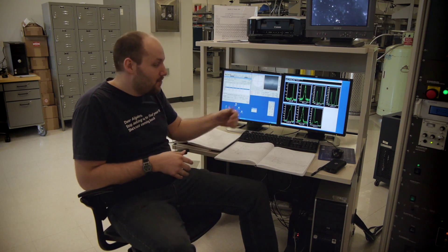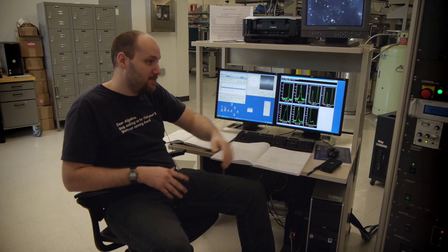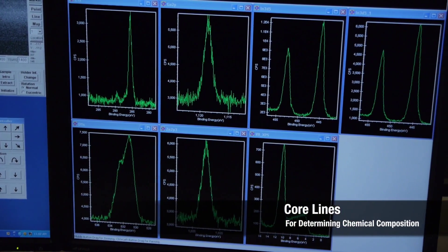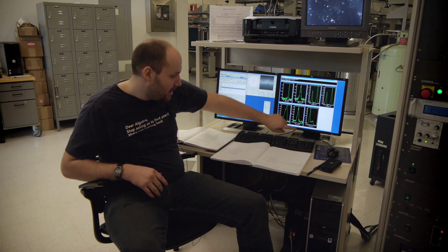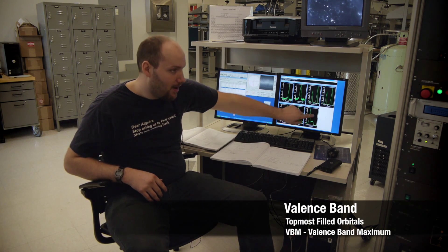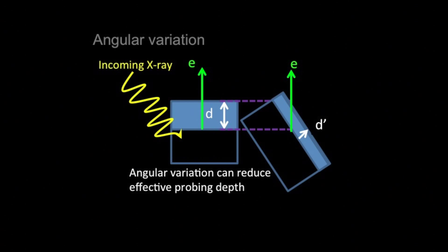Hello, my name is Sean Salas, and I work with Dr. Lewis Piper. I'm a PhD student in the materials science program. Over here we've been taking some data from our XPS machine. This is kind of what it looks like in raw form before we analyze it. Each one of these little graphs is a specific region corresponding to a specific element — we have carbon, gallium, indium, oxygen, and zinc. And here we have the valence band where we can probe the VBM of our sample. I've just finished this scan and now I'm going to move on to doing more scans.